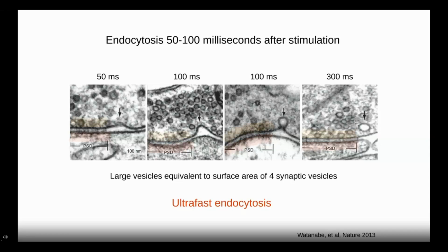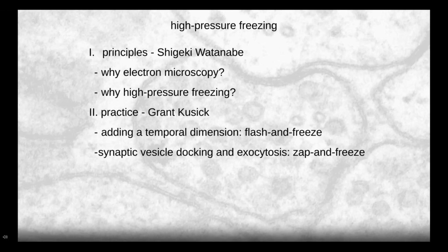But what I'm going to talk about for the rest of today is my focus, which is on synaptic vesicle docking and exocytosis, and how some of that work has been enabled by the next step in the new generation of time-resolved electron microscopy, zap and freeze.